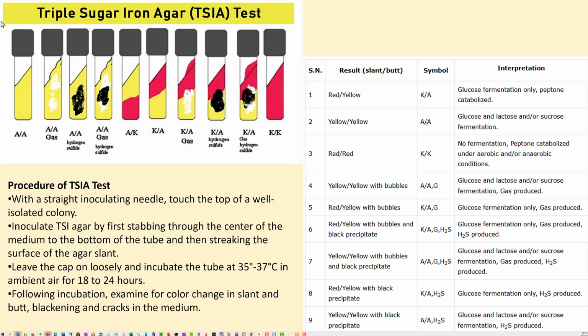So all of these help identify the characteristics, and one of the challenges I have for you, I'm not going to ask you this on an exam, but looking at KA, AA, looking at some of the differences, look at all the information that we can obtain, and remember, we can use this information to identify these microorganisms later on. So that was what this process was about, to identify microorganisms, and a lot of this data will be provided for you to help identify your unknowns, and so you want to be able to interpret the tests and then identify the microorganism.